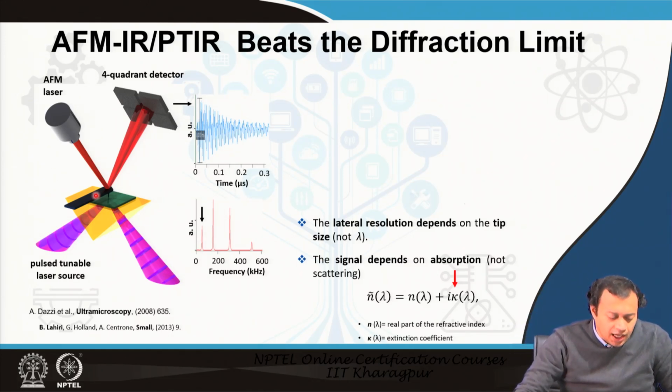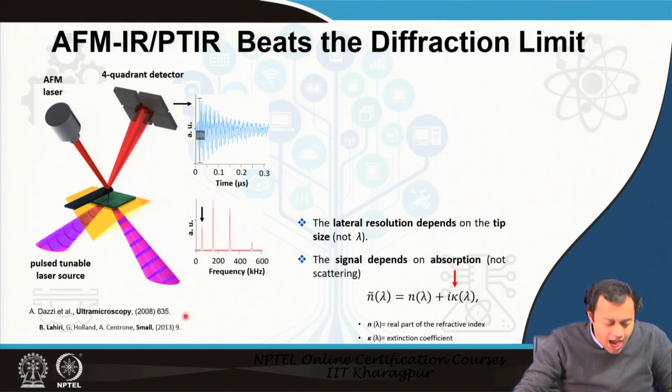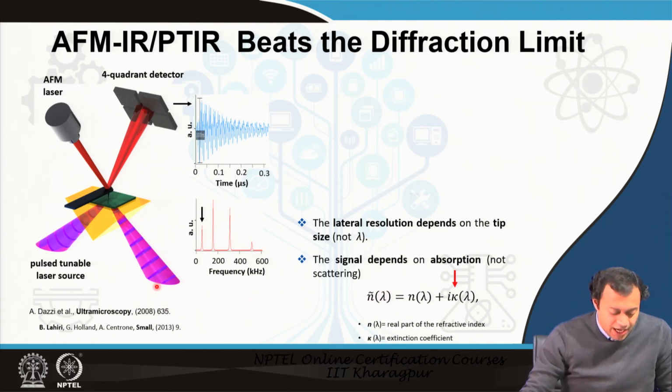While the tip is scanning the sample from the top, I illuminate my sample. Yes, I can boast, because I myself personally do that, along with several other members who do that as well, but I did it. So, I will grab with both hands the opportunity to boast, if I may.